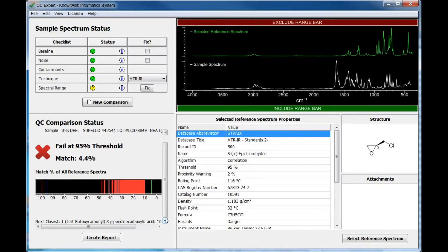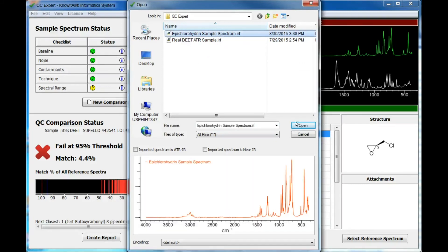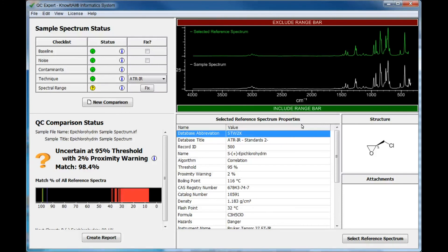We will now look at a final example where the results are uncertain. Let's compare a sample spectrum of S-epichlorohydrin to the S-epichlorohydrin reference spectrum. The match percentage to the reference spectrum is excellent at 98.4%, but Know-It-All also compares the sample to the entire reference database set by the administrator. In this case, we see that the results are uncertain, as the sample is also a close match to another spectrum in the reference database that is above the threshold set by the administrator.